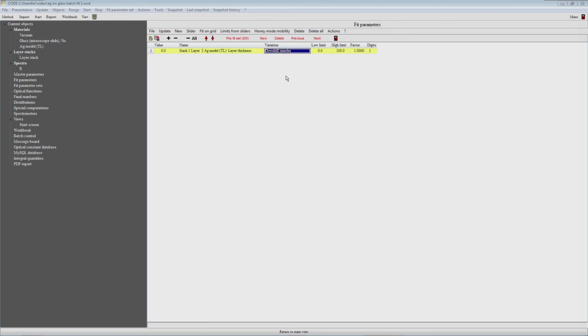There are some more settings, and you can cycle through all the settings with the function key F4. If you press F4, there's an empty cell. If you press it again, there's the item grid 10 points, grid 20, 50, 100, and so on. There are several settings, and when you are cycling through, you finally arrive at downhill simplex again.